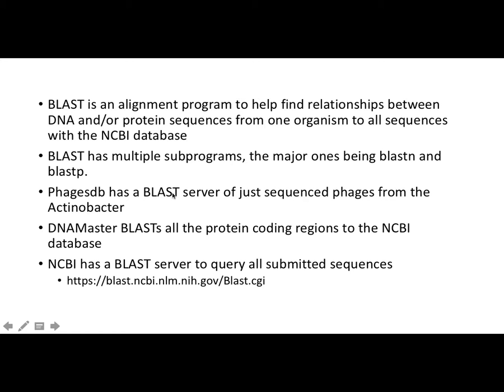PhagesDB is a BLAST server just for the Actinobacteria phages. DNA Master blasts all the protein coding regions that have been identified in your phage genome, and NCBI has a much greater capacity to do alignments, but it's limited by what's in the database. And with that, I will stop.